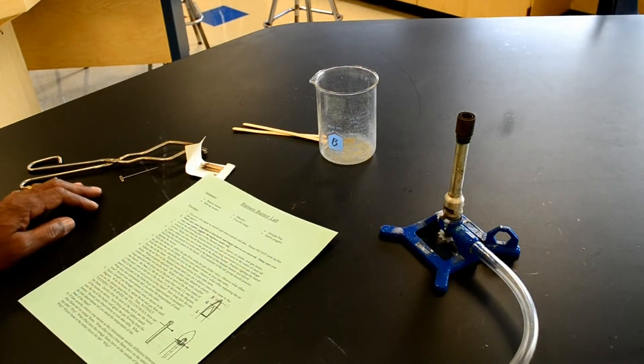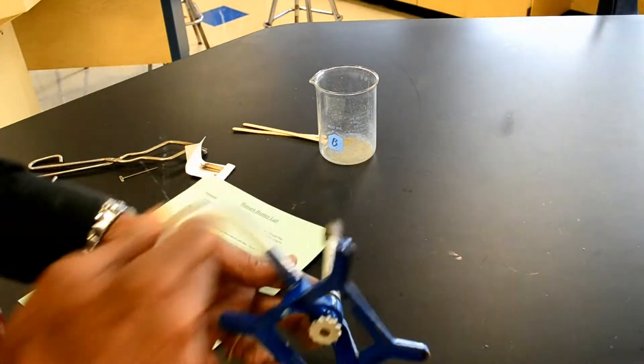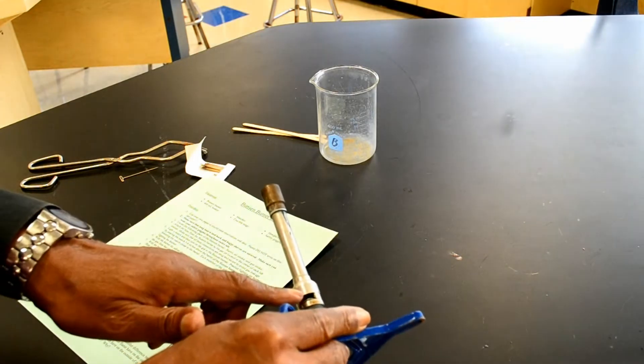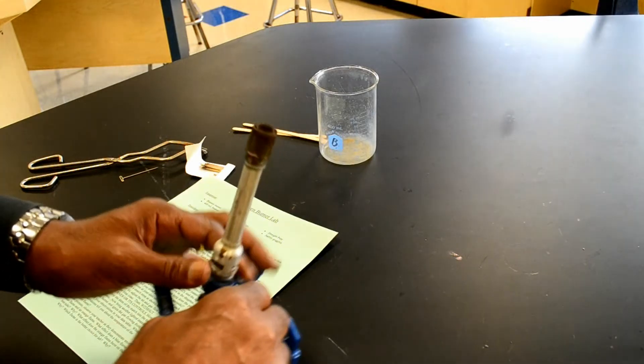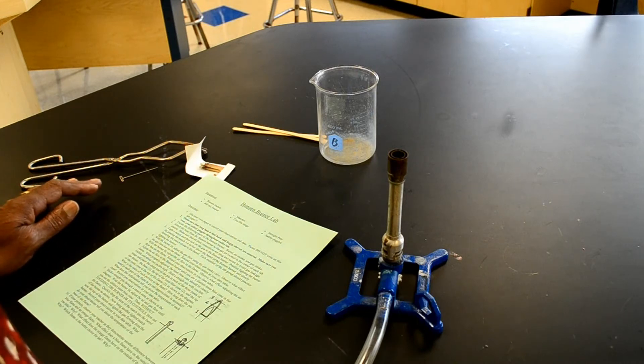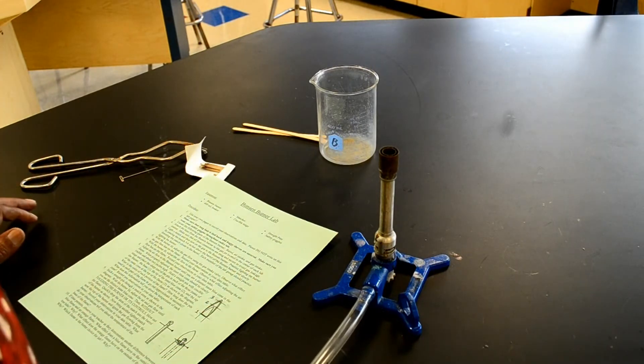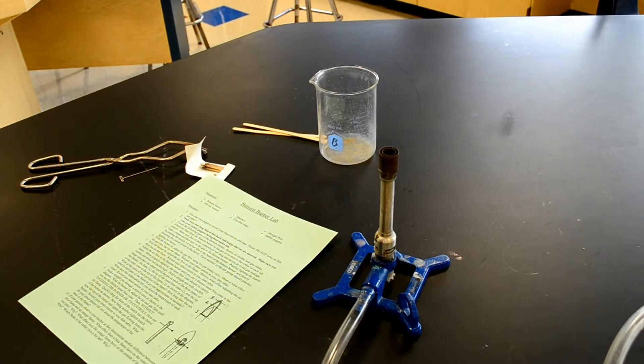Now for the procedure. It says locate the parts of the Bunsen burner where we have the barrel, we have the air intake, and the gas intake. Then it says attach the burner hose to the gas jet in the center of the lab station. Make sure all hose connections are secured to avoid gas leakage. So I'm going to secure the hose to the jet. And we're done. It's snug.